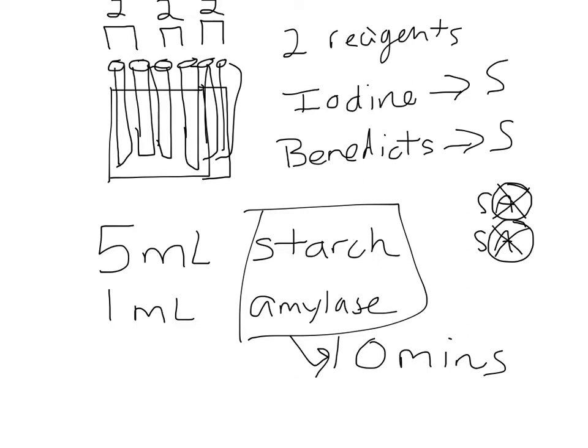Okay. So what you really want to know is that you want to see first how starch reacts, you want to see how amylase changes results, and you want to see how denatured amylase will also change the results from what you think. Okay. Also to keep in mind, I'm just going to erase this.